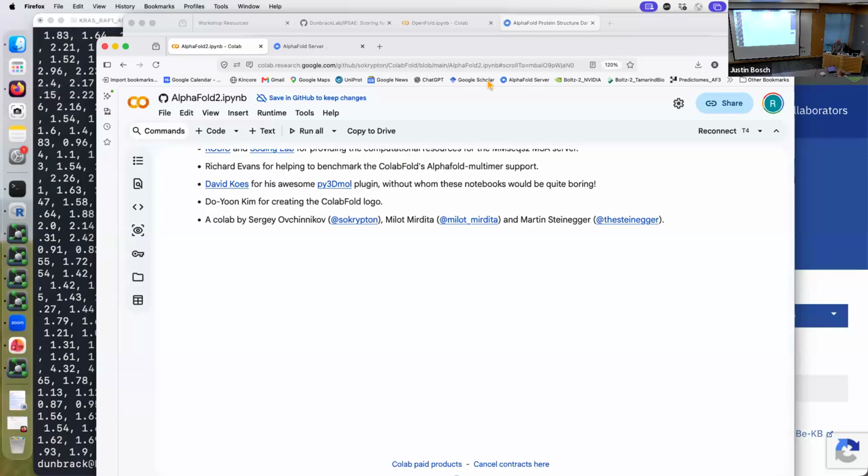So let's hope this works. You can download IPSAE. I'm not going to do it right now. It's just a Python script, and you use it on the command line. You type python3, ipsae.py, that's the name of it, the name of the JSON file, the name of the PDB file, and then 2 numbers, the PAE cutoff and the distance cutoff for the context. So I do like 10 and 15. And then that automatically outputs the text files. Let me show you one other thing.